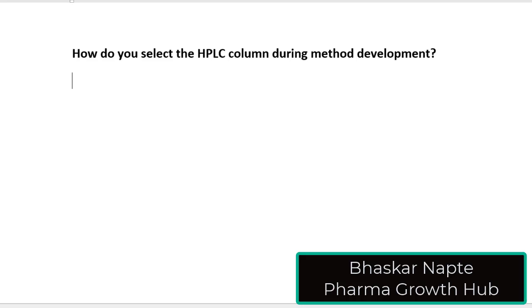Now, this is a very broad question and there can be multiple possible answers. But how can you construct the answer so that the interviewer will see you as someone who has a deeper understanding of HPLC column chromatography? You are expected to talk about the stationary phase and the possible interaction of the stationary phase with your molecule. If you can bring this information as part of the answer, you can build credibility and certainly influence the interviewer.